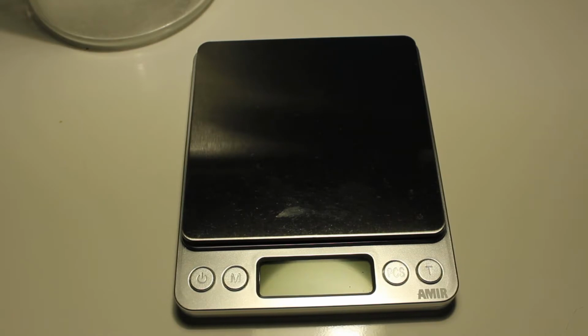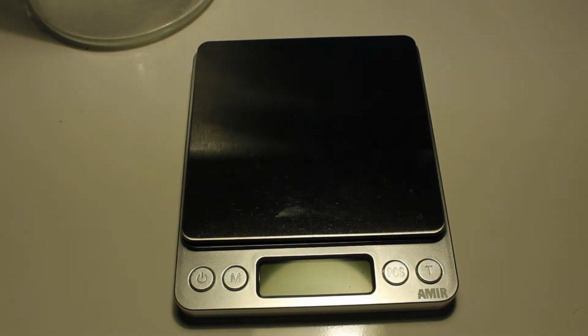The final step in this process is to weigh out what we have made. I'm going to expect 100 grams, something around there. I'll probably have less though, especially because this is only one beaker with the crystals, and so it's not my entire yield.